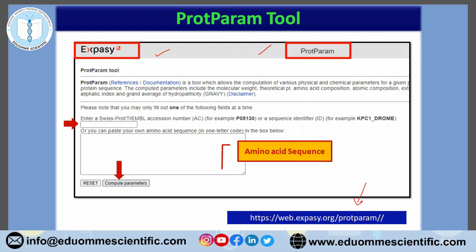Here, the protein information can either be specified manually or you can get it by your accession IDs. You can use UniProt and TrEMBL accession IDs of a particular protein, or you may also paste your sequence here. So if you have your own peptide or protein sequence, you can paste it here, or provide an accession ID, and then compute your parameters.